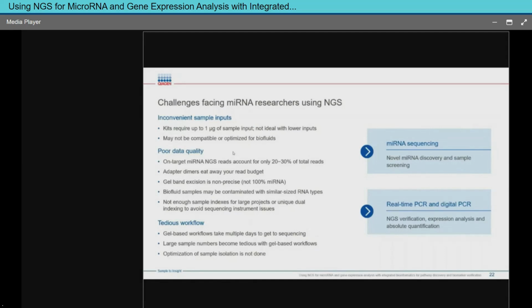These are readily available samples that you can get from a blood bank or collaborate with somebody doing clinical research or seeing patients, and you can quickly accumulate hundreds of samples very quickly in your studies.